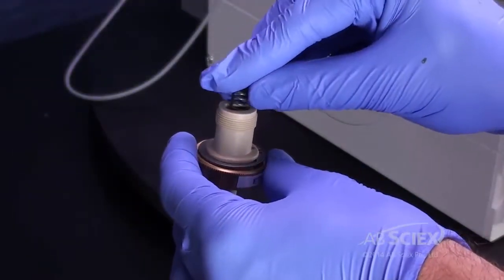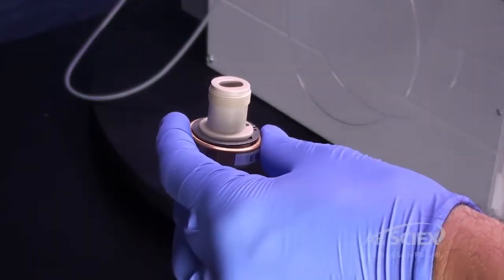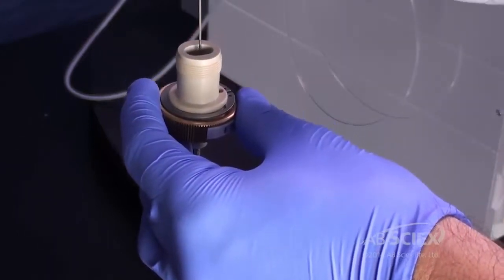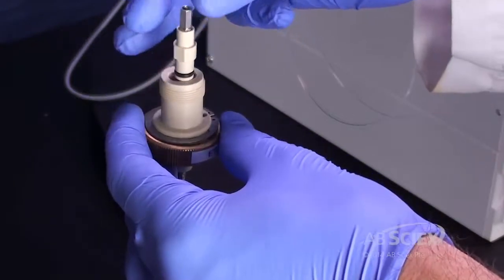To reinstall the new electrode, hold the probe downwards and ensure the internal spring is in place. Slide in the electrode and refit the black electrode adjustment cap.